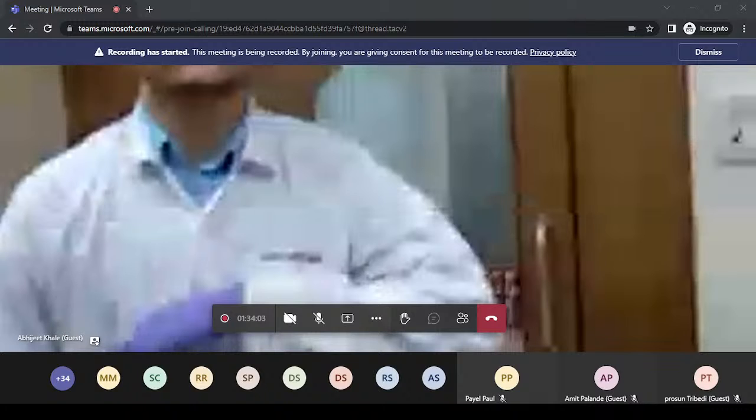So it is more and more accurate sample application without touching the stationary phase. So this is contactless application and spray-on technique. Nitrogen gas or compressed air is connected to generate a fine spray of liquid sample. That spray will fall onto the plate, and we are applying samples in the form of bands and not spots. So band-wise sample application will give us a better resolution after chromatographic development.